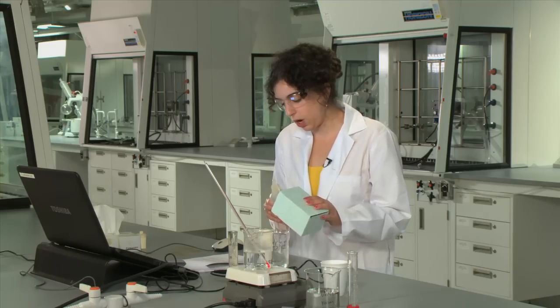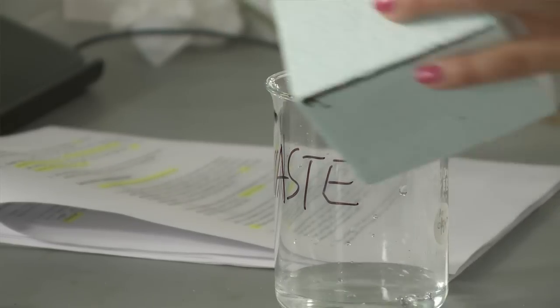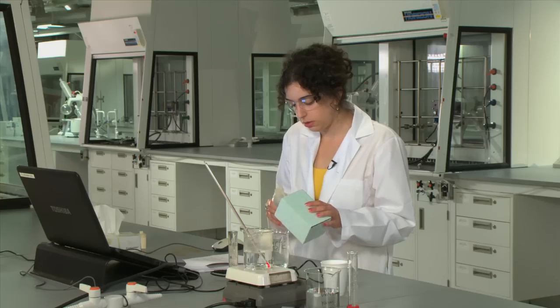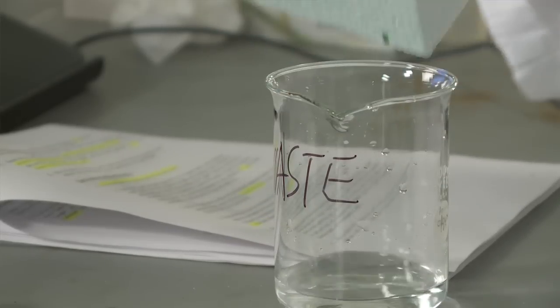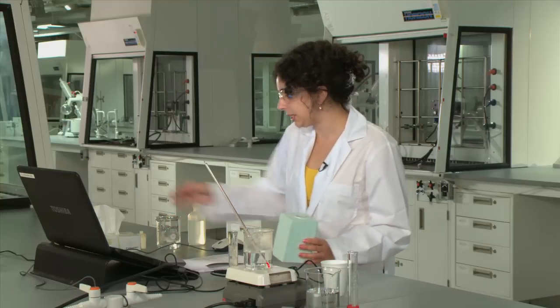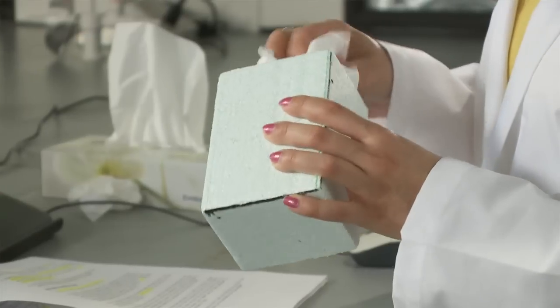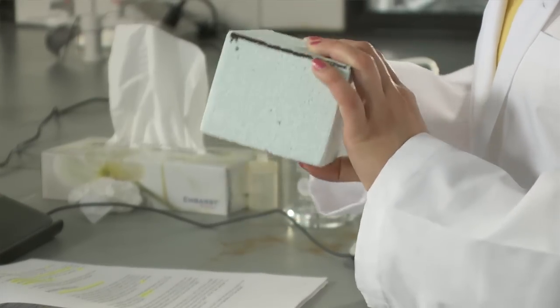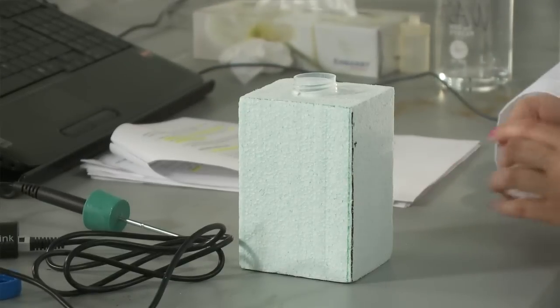You can give it a rinse with your wash bottle or you can use some more of your room temperature water from your beaker. And then to the best of your abilities dry out the inside of the calorimeter with a kleenex and then your calorimeter is ready to go for your next trial.